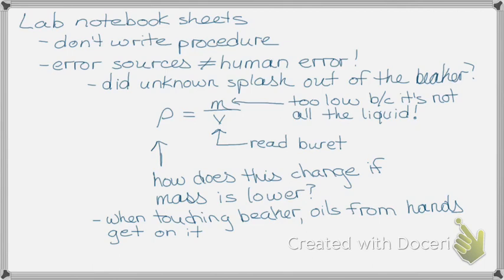So do the same kind of exercise. Think about, okay, now what is that going to do to the mass of my liquid? Is that going to make it too low? Is that going to make it too high if I'm adding oil to the beaker from my hands instead of just the unknown? And how does that affect the density? So that is going to be your lab makeup.